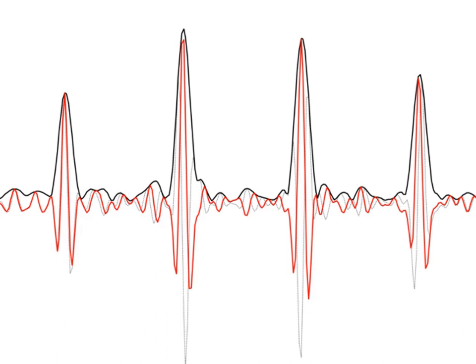So this could be because their frequency has been shifted, perhaps by space charge or peak coalescence. In that case, maybe you would not expect the mass accuracy of those peaks to be as high as for other peaks in the spectrum, and you can take this into account during assignment. Or maybe these poorly phased peaks are actually harmonics or some other signals contaminating your data, in which case any assignment for them must be wrong.